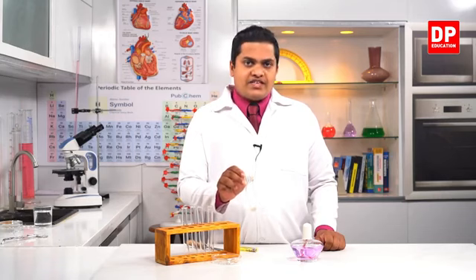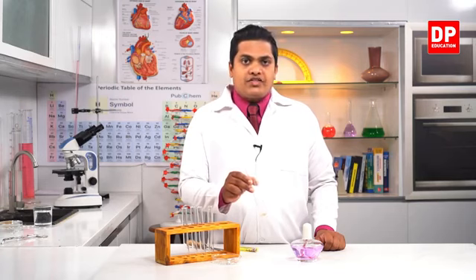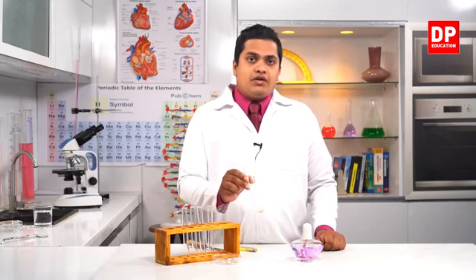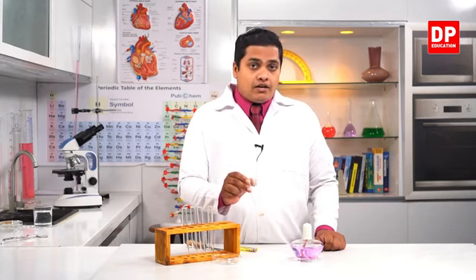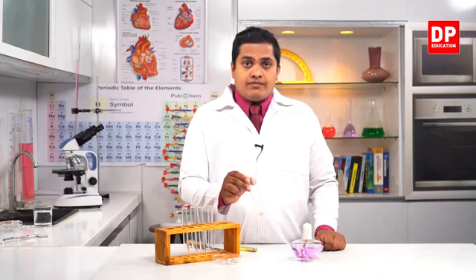Once again, the liquid state has changed to the solid by reverting the temperature or the heat energy which is supplied. So, this is a good example for a physical change. Now, let's move on to observe another experiment to see these state changes in matter.